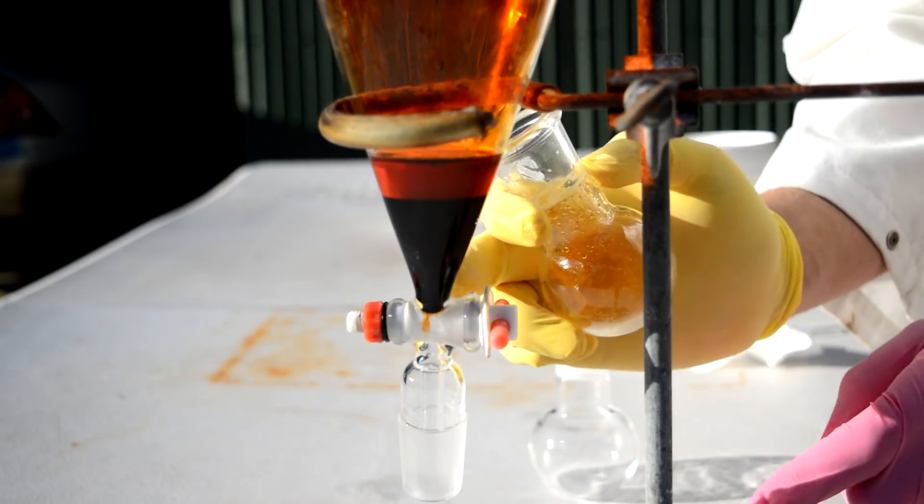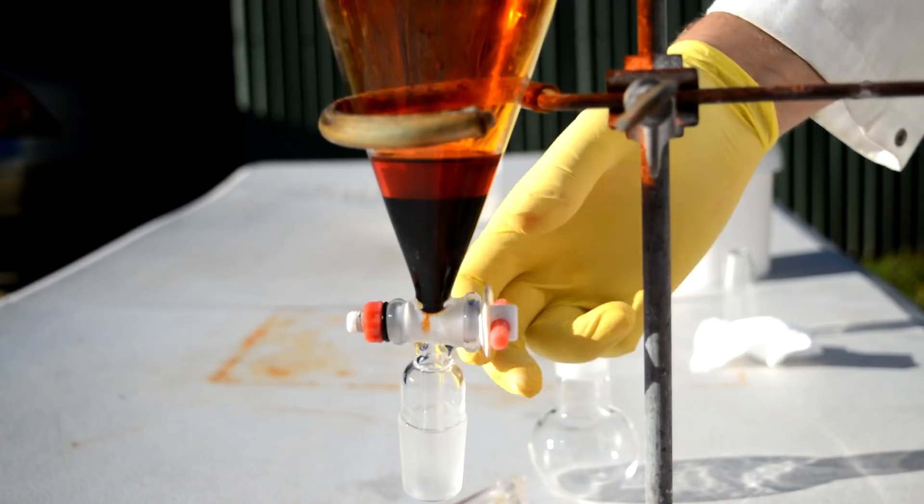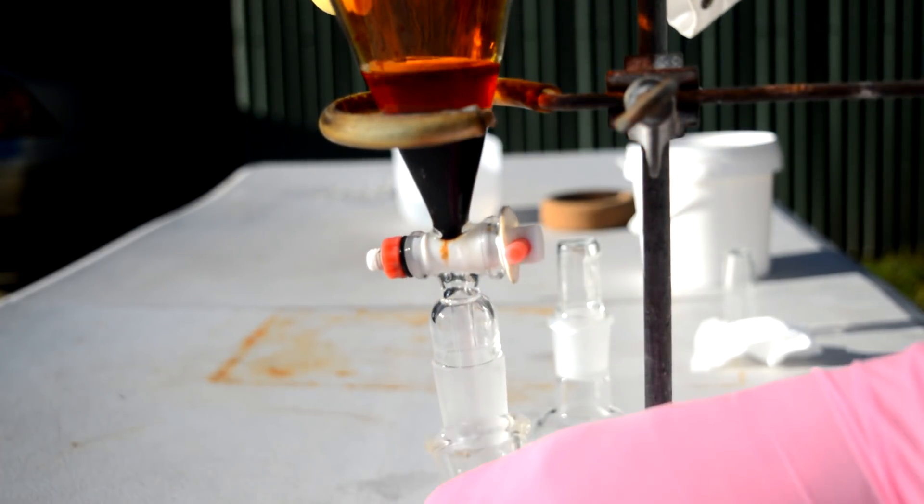I'm gonna sacrifice a little bit at the bottom here just to make sure this section of the separating funnel is all clean and everything like that.